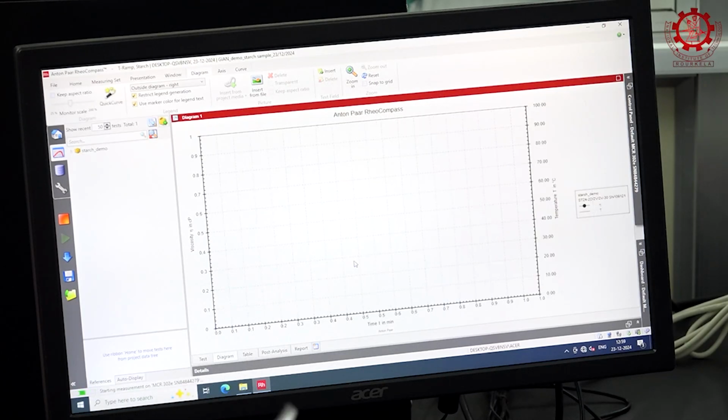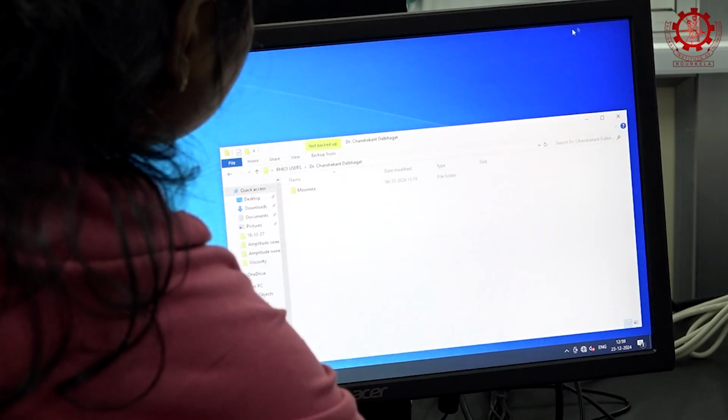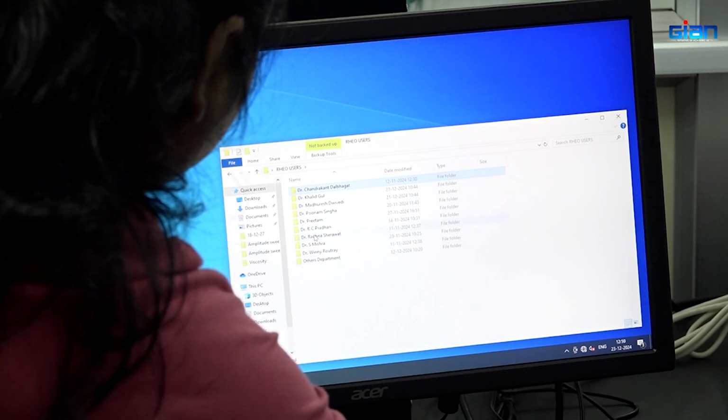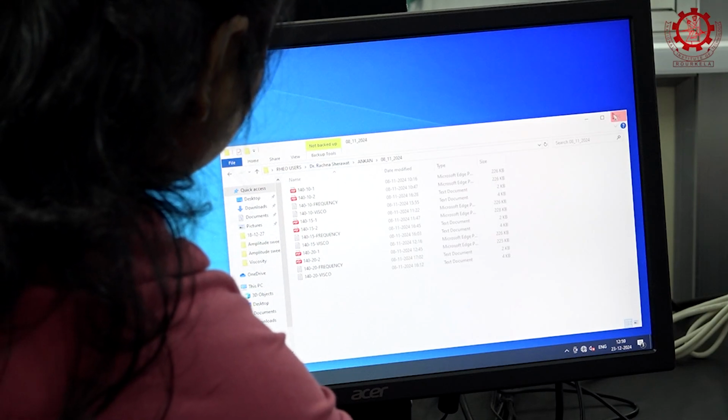Okay. It will take 23 minutes. We will be showing you a model of how the results will come. It will keep on running in the background, but since it takes more time, I am showing the result, how the results will be.